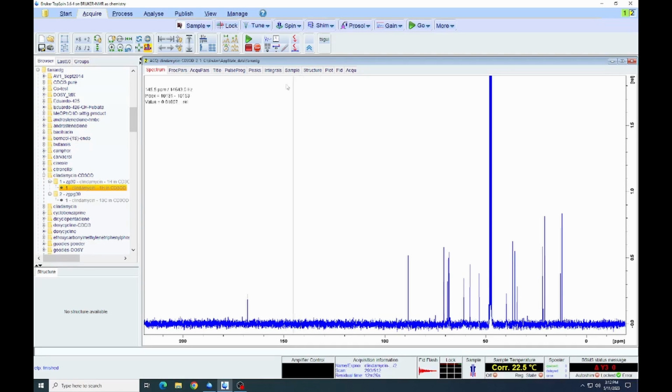You'll notice up in the toolbar that we have this stop sign. Notice it says that it's emergency stop. It will not save the acquisition, so we do not want to click that one. Instead, we click the halt button next to it. This will stop the acquisition, but it will also save the data that we've collected so far. And so now we have our spectrum.